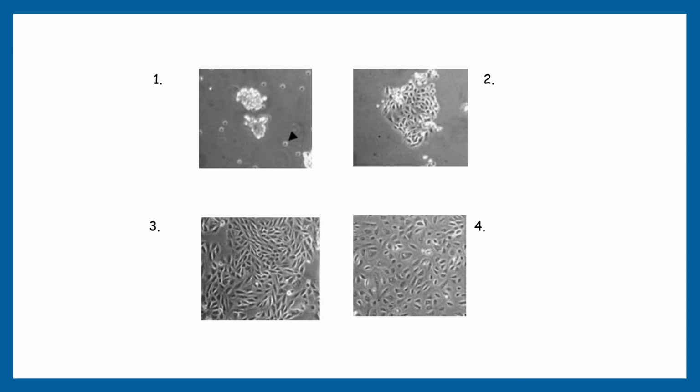In figure 2, a colony of ovarian surface epithelial cells has attached and started to spread on the tissue culture plate after 4 days. In figure 3, outgrowth of ovarian surface epithelial cells from a cluster can be seen. In figure 4, a confluent monolayer of ovarian surface epithelial cells can be seen, which depicts the typical epithelial cobblestone morphology.